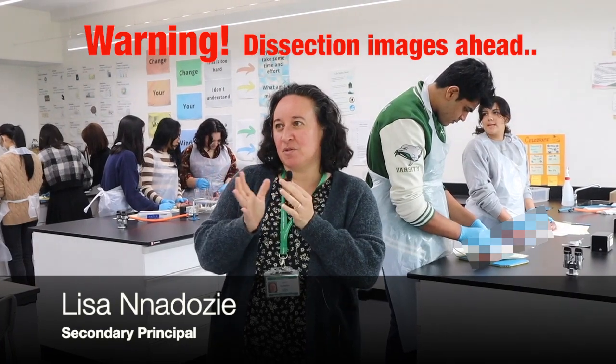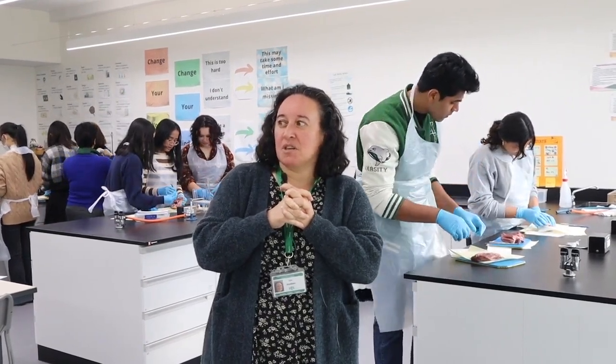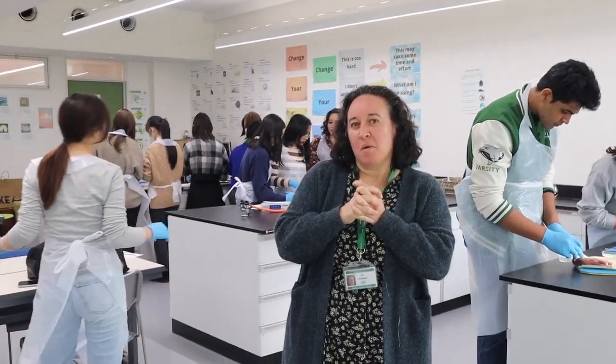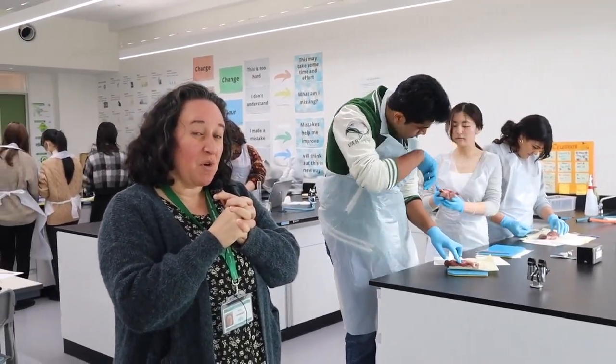We're in our beautiful biology classroom and we're in a grade 12 class. Students here are at the moment looking at some of their learning and doing a practical by dissecting some pig's hearts. Let's hear from some of the students as to what they're doing and what they're looking for and why they're doing it.